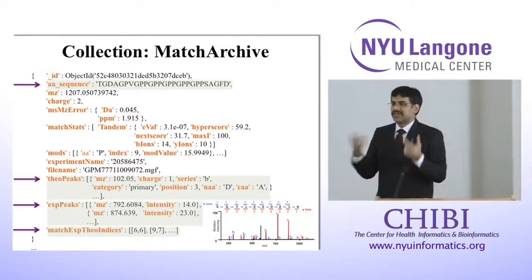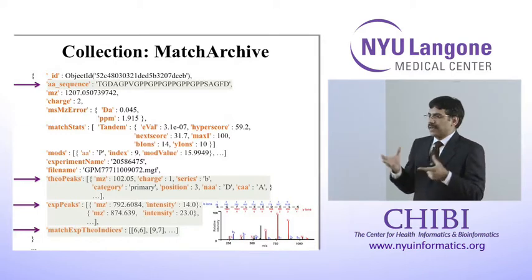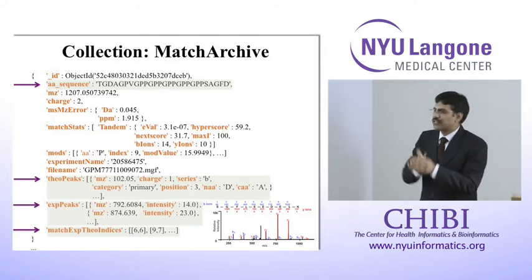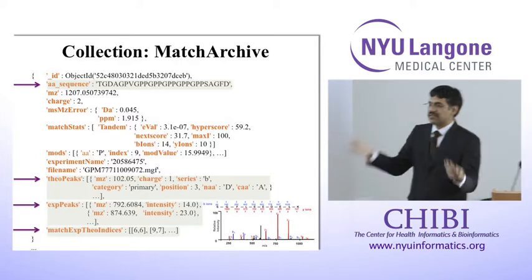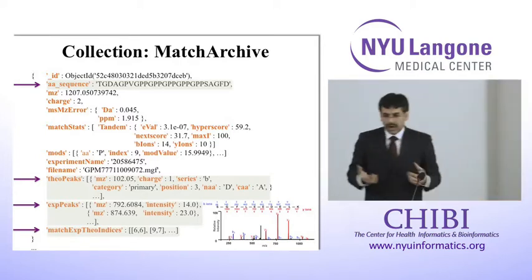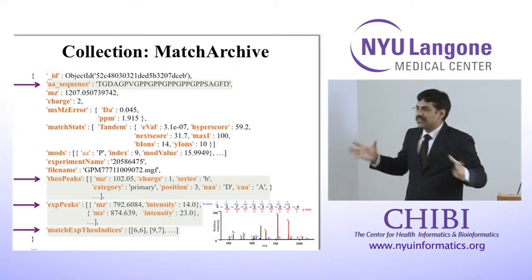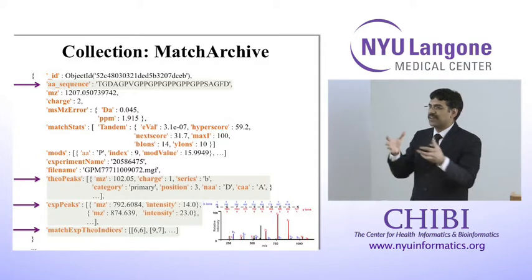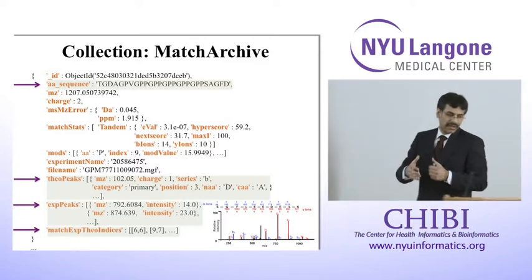So let's say we narrow down from our query to 500,000 documents. These documents will correspond to the peptide sequence list that we gave. So let's say the first peptide had about 20,000 documents. So it had 20,000 matches in my database. Peptide 2 had, let's say, 30,000. Okay? So our goal is to find the 5 most abundant peaks for a peptide sequence. So we need to gather all those 20,000 observations or instances in order to get the final result. We can't just pick out 5 or 10. We need to look at all those 20,000 data points. Okay?